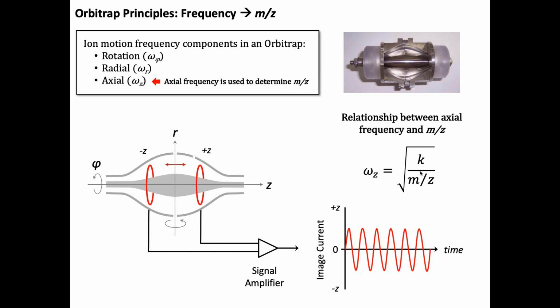That's why you don't see as much of the multi, because it's only singly charged things. Right? Yes. So the frequency is not depending upon the mass, but it depends upon the charge. Mass to charge. Yes. Mass to charge.